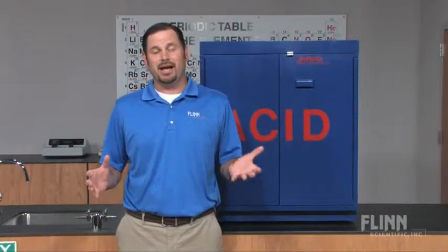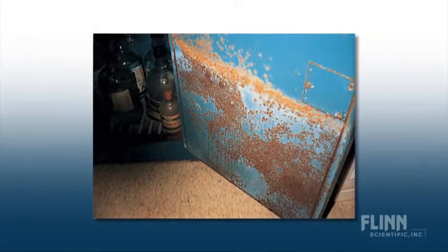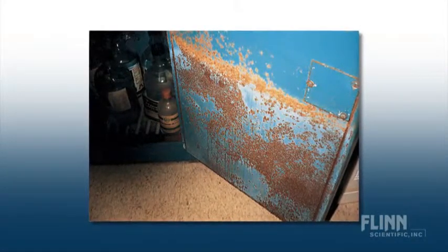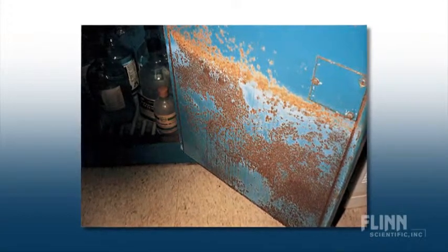Metal cabinets are not acceptable for acid storage. Take a look at the corrosion in this picture of a metal acid cabinet that is only three years old. It is only a matter of time before the shelf supports in this cabinet corrode through and collapse.